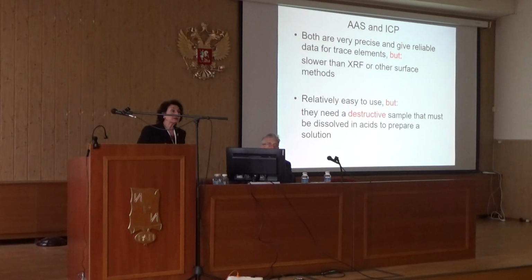The problem with this kind of analysis is, of course, that you don't get the results immediately. Of course, with a portable one, a pistol, you get numbers immediately, but they are not reliable. With my transportable one, which is bigger, you need to elaborate the data.